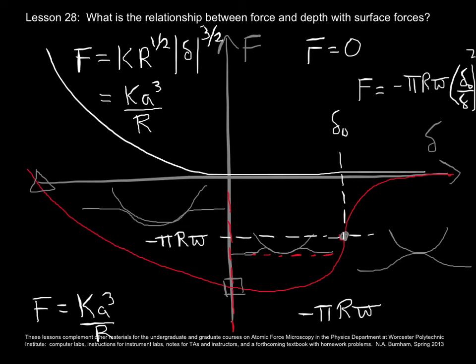What's happening is that the tip is coming closer to the semi-infinite half-space of the sample. At the same time, it's touching the little bulge of the sample. You can write this as minus a big long square root now, 3 pi work of adhesion, reduced modulus, contact radius cubed all over 2.